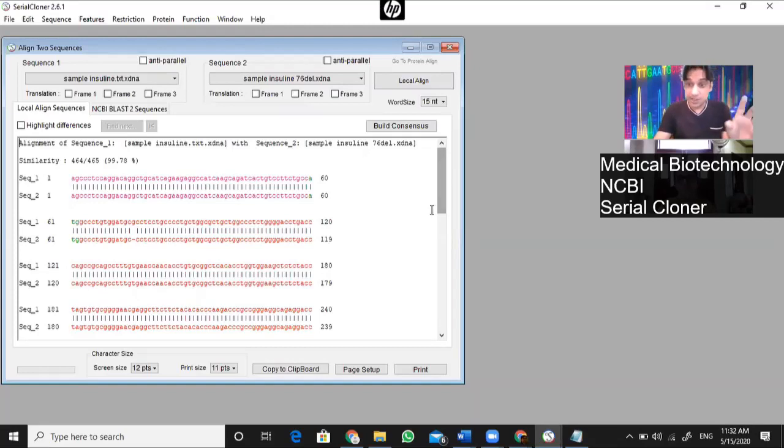In order to read these, you know, अब लगेगा ना किसी को pressure डालना ना अब आपने किसी को अपने साबित करना है कि आप एक अजीमुशान scientist है. You can use these type of things. Oh my God, क्या मजे की बात लगी.